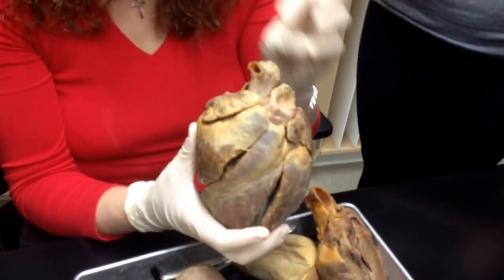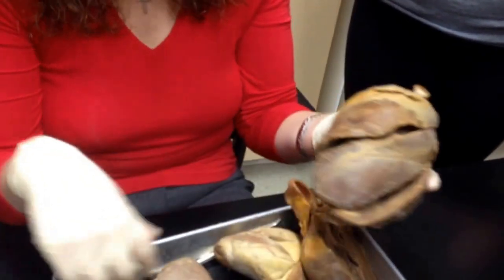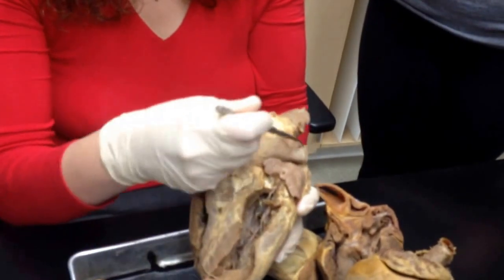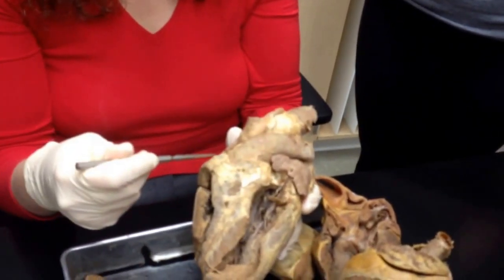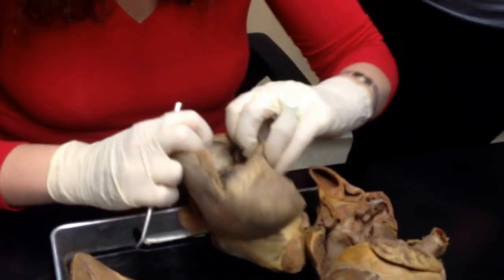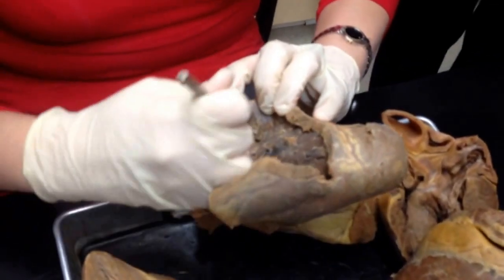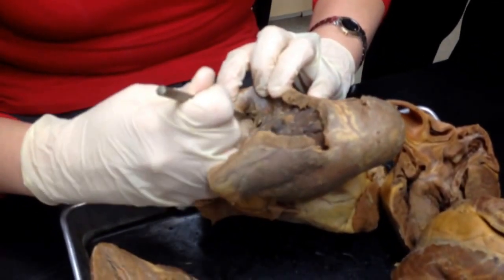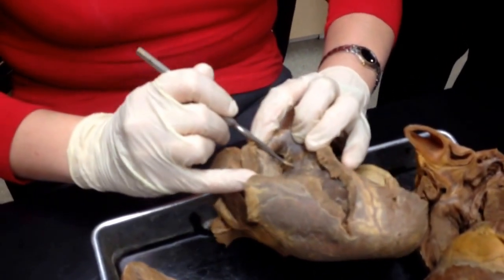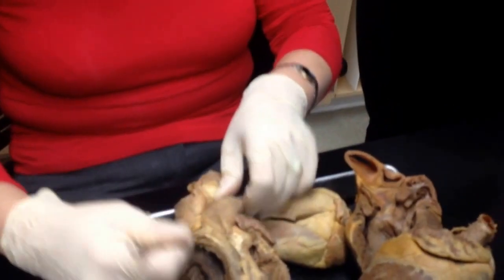Now, valves. We've already covered the tricuspid and the bicuspid, so let's talk about the semilunar ones. Key thing with the semilunar is the base of the pulmonary trunk and the base of the aorta. Here's the pulmonary trunk. If I go to the base of it, those flaps that you see here that I'm pulling on, that is the pulmonary semilunar valve. So at the base of the pulmonary trunk, you find that.